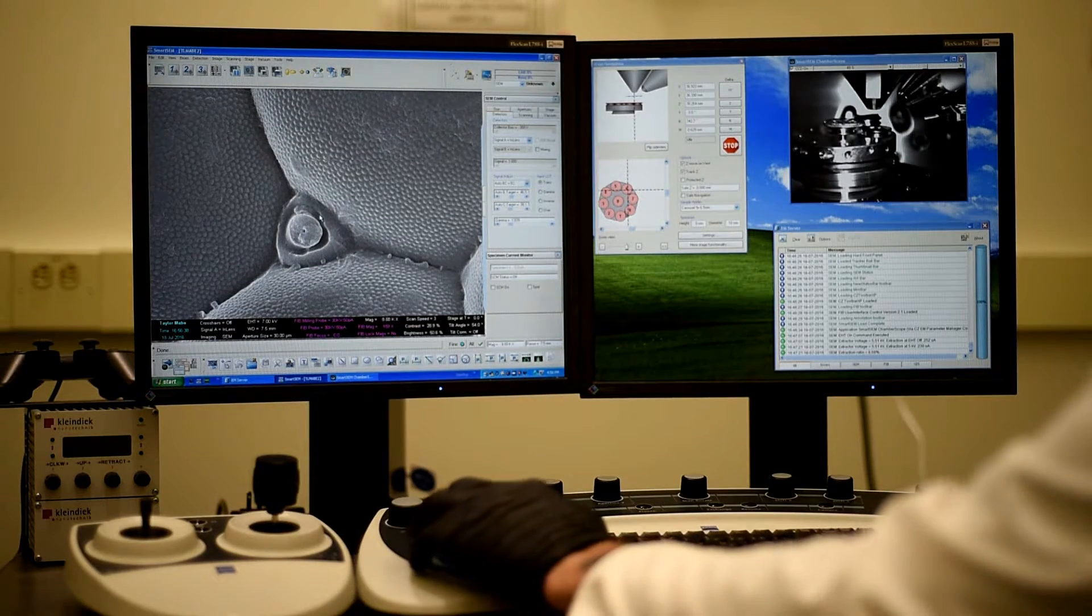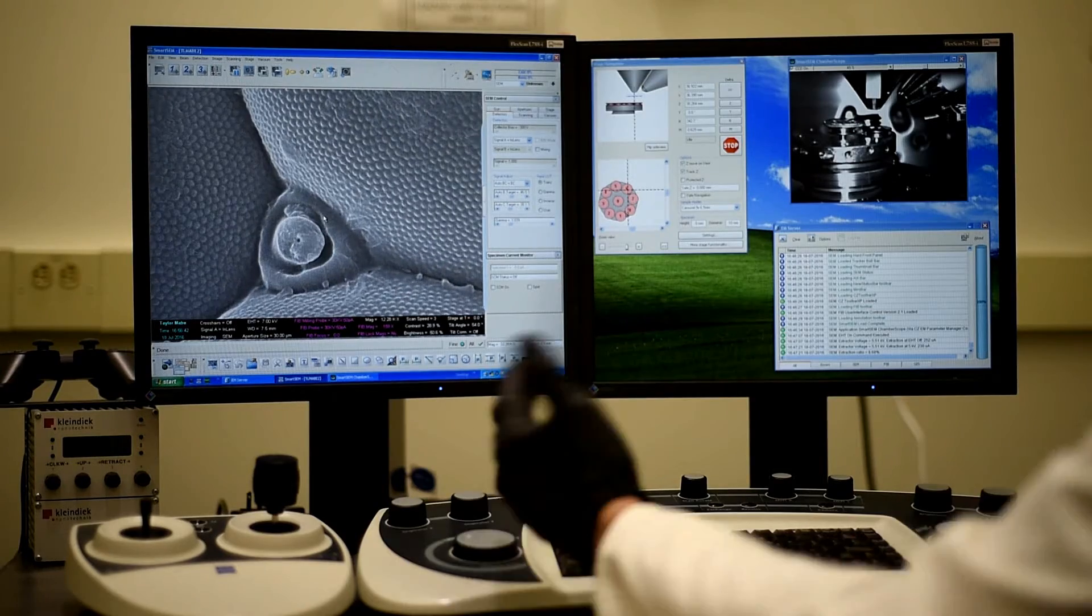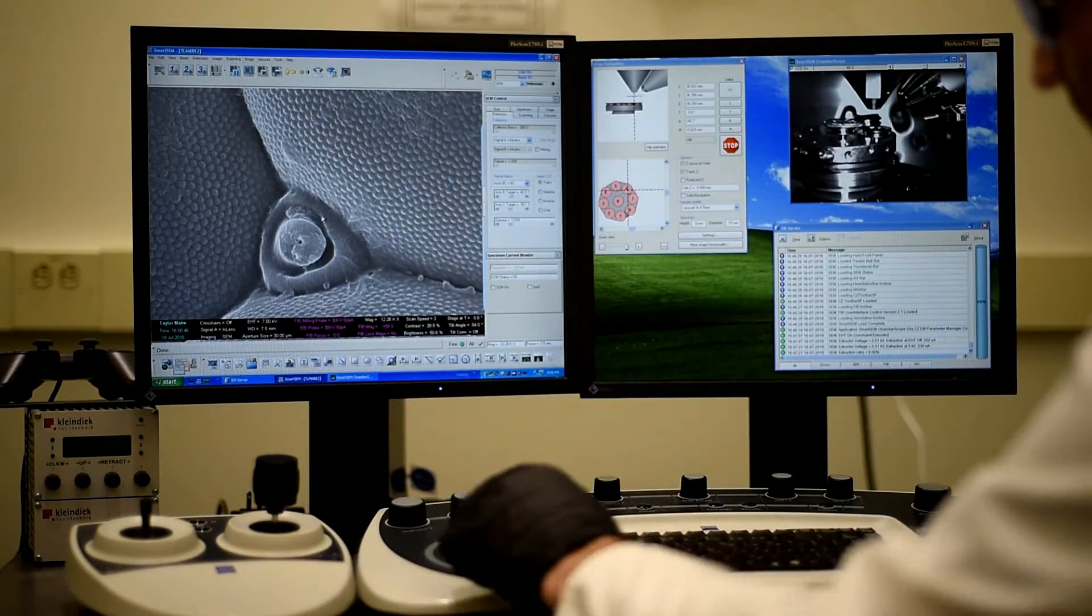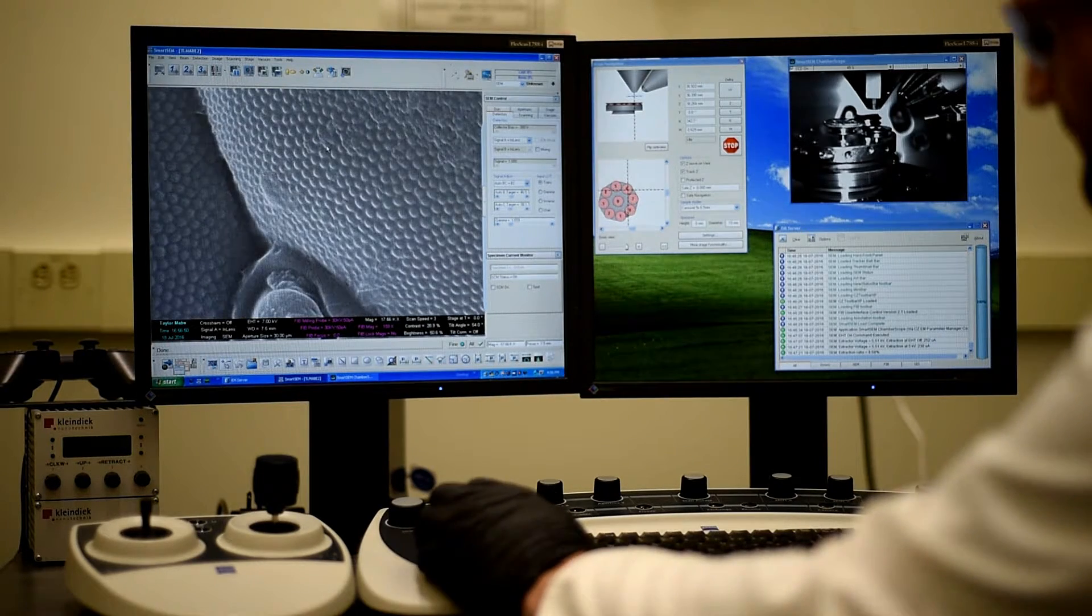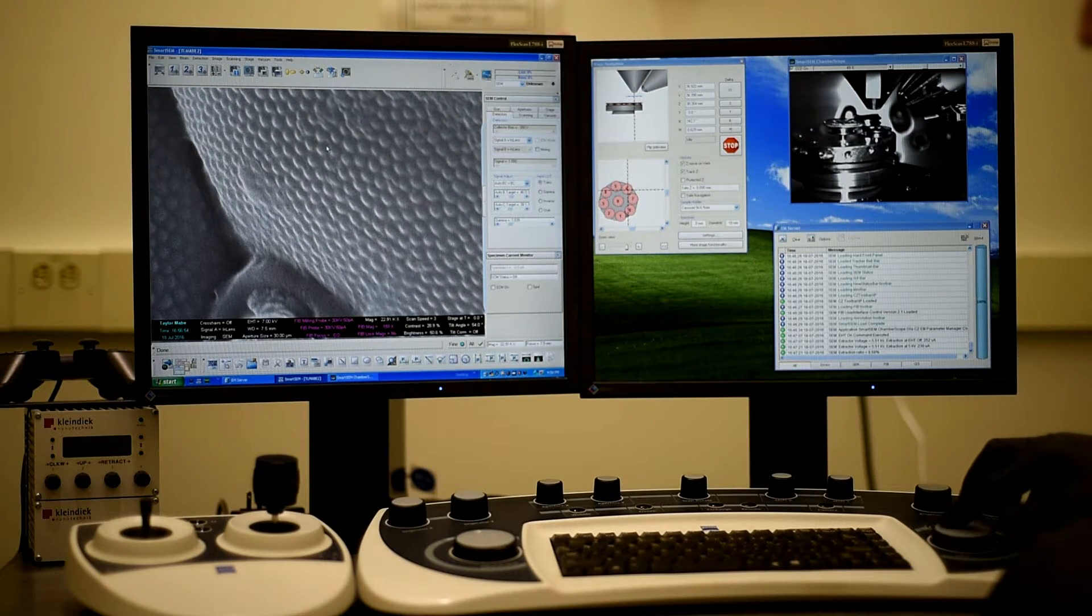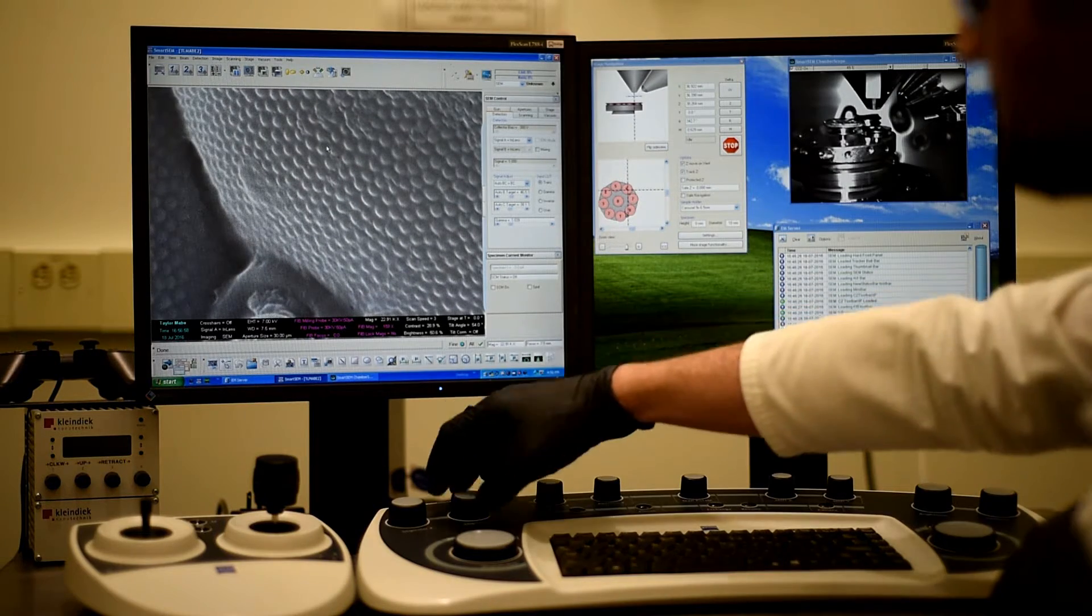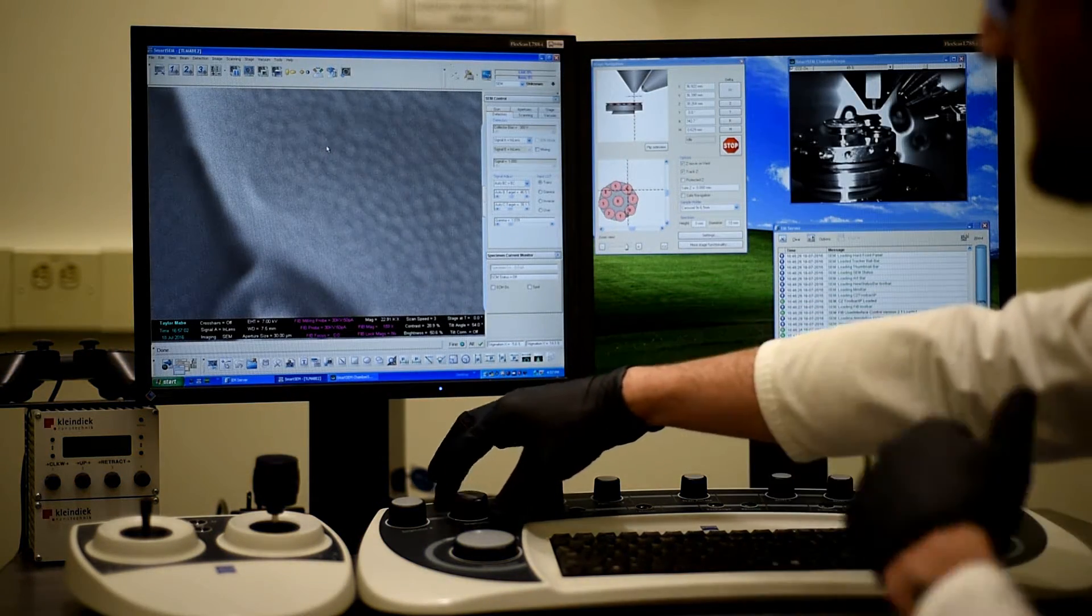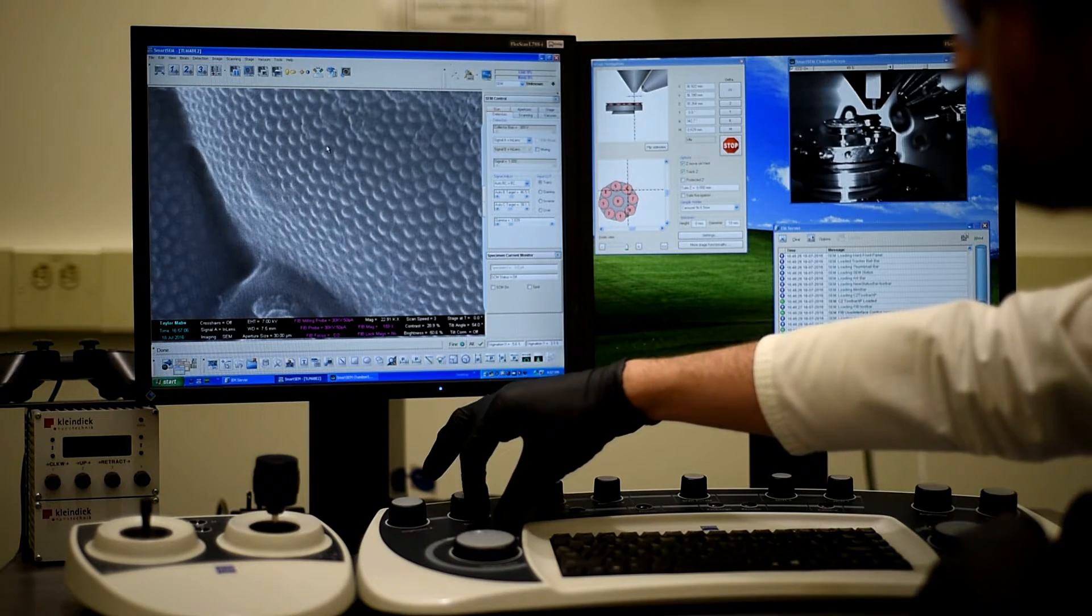Well, if we get up to, say, several thousand times with magnification, at this point you adjust the stigmation. So you use the stigmators X and Y to further clean up the picture. So first we're zooming way in. See there's some movement. So let's adjust the stig. And you can see now I'm just in stig. It got messy. So I'll go back. And there it's messy again.